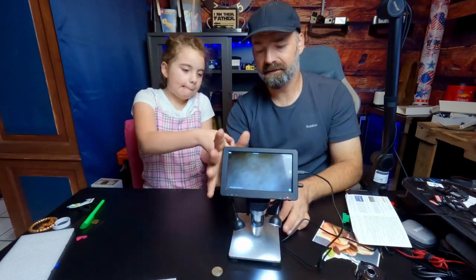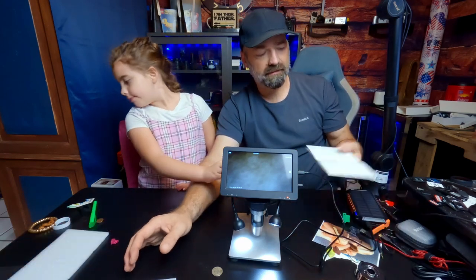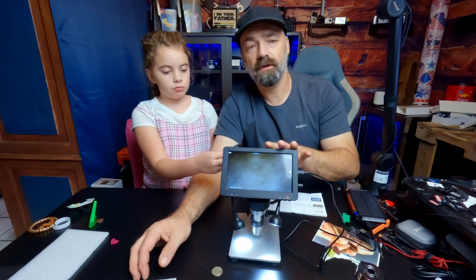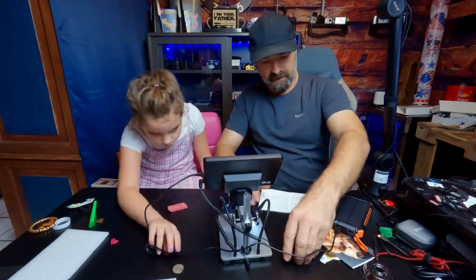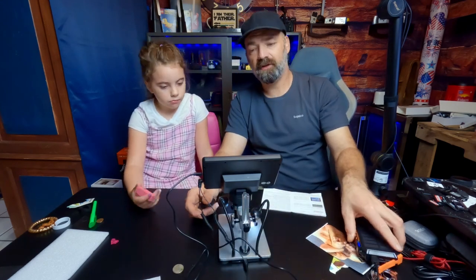This thing not only comes with everything I showed you, it also comes with an installation disk, a full manual, and a 32 gigabyte memory card so you can record your photos and videos. We're going to spin this around, hit record, and Lizzie Jo and I are going to start looking at some different things to share with you.